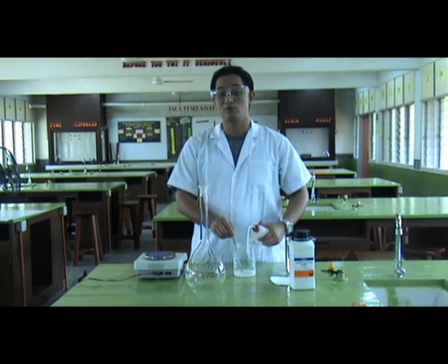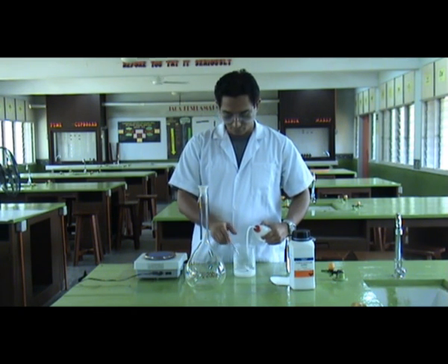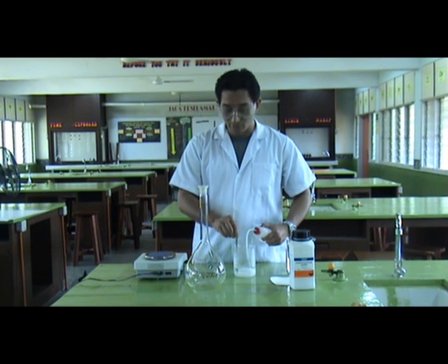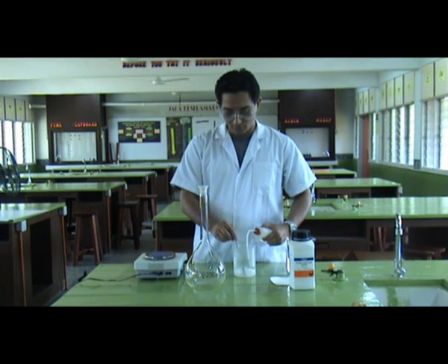Sodium hydroxide is also known as lye, and it is used to make soap. As we add water, we can feel the heat from the exothermic reaction — it is very hot.